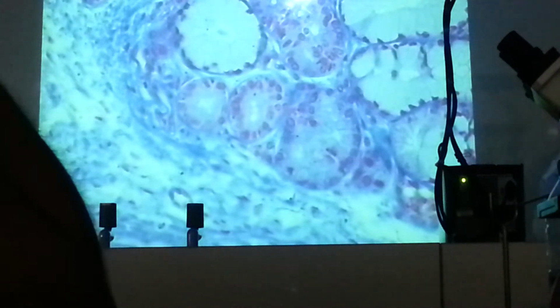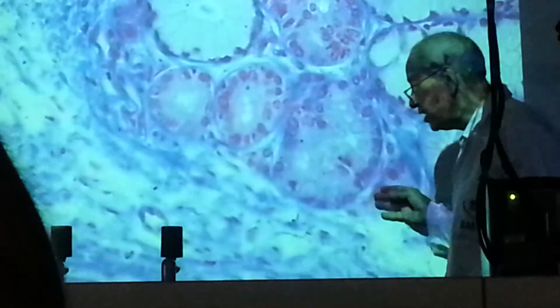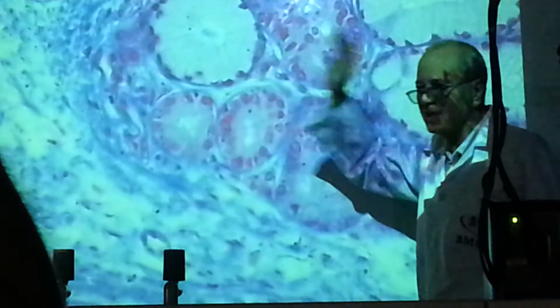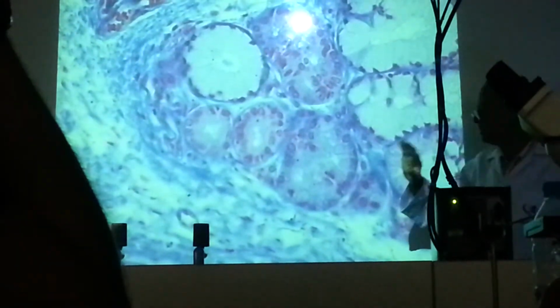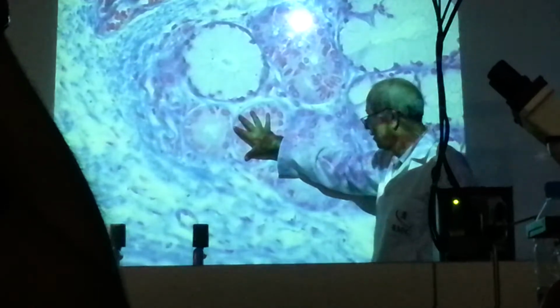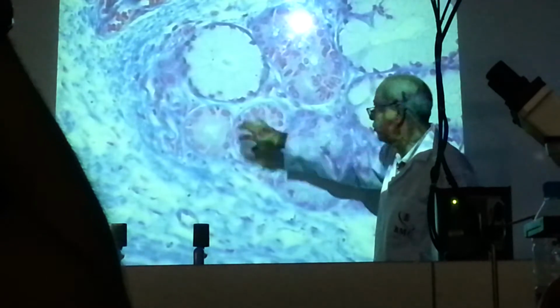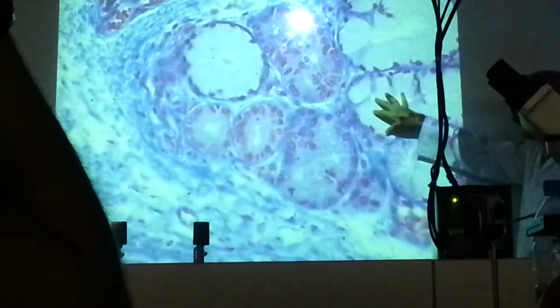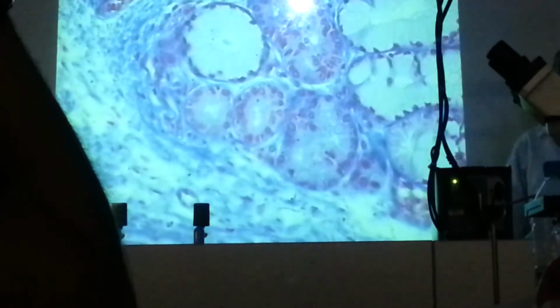One more time. What is the identification of the section? Name of the section? What's present? Serous and mucous acini. If you started by serous, they are smaller, darker with rounded nuclei. Mucous are larger, paler with flattened basal nuclei.